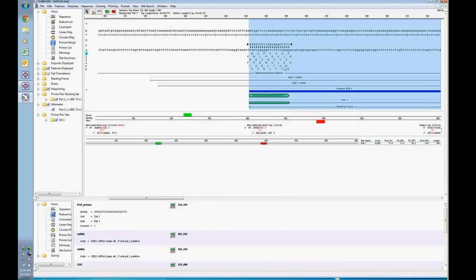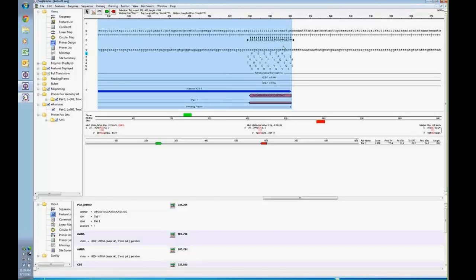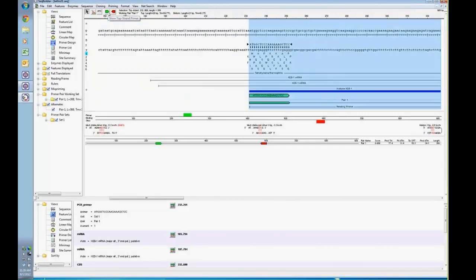Okay. Once you do so, you can clearly see that there's a top strand primer that's created. If I click on this palette tool showing the little red bottom strand primer, it's going to quickly navigate to that 3' primer. I'll click back to the green one showing the top strand primer. There's also some primer binding site information shown here. This will show you whether there are any possible false binding sites across the target that's in the project, as well as where they exist, if they do exist.